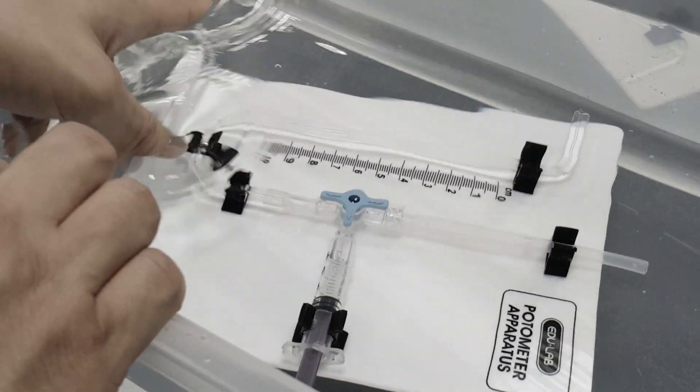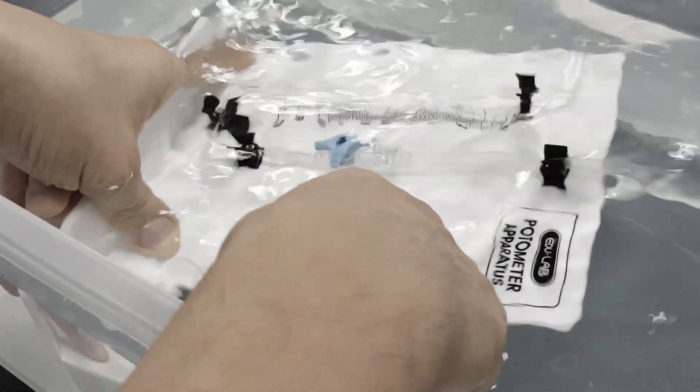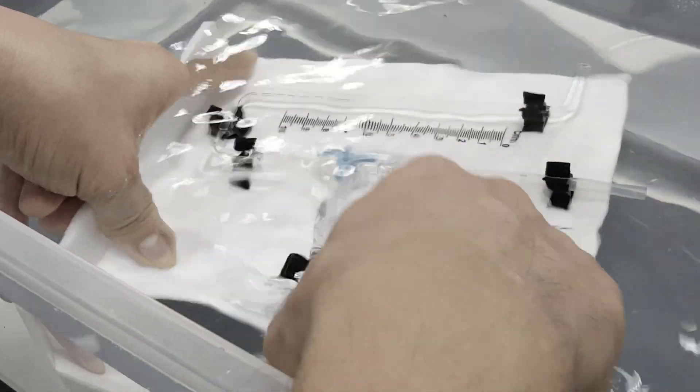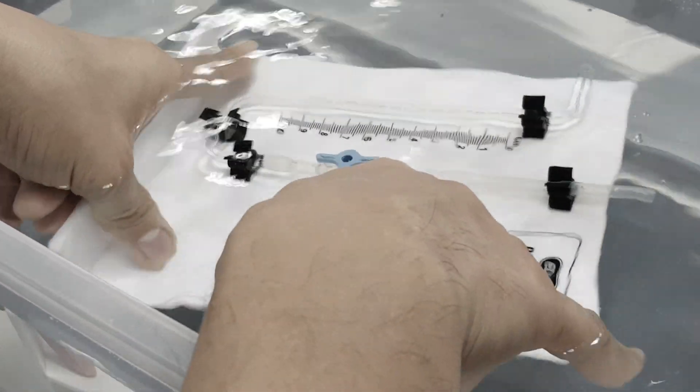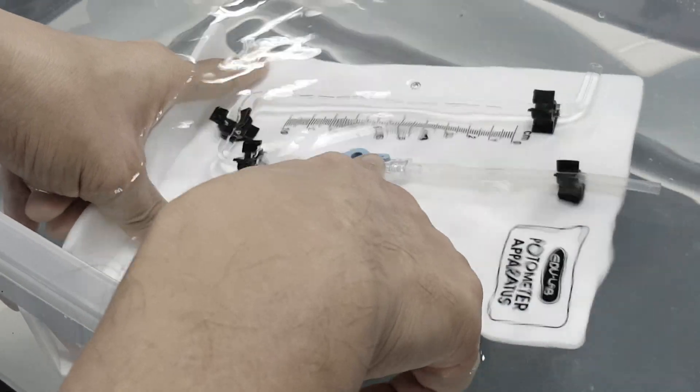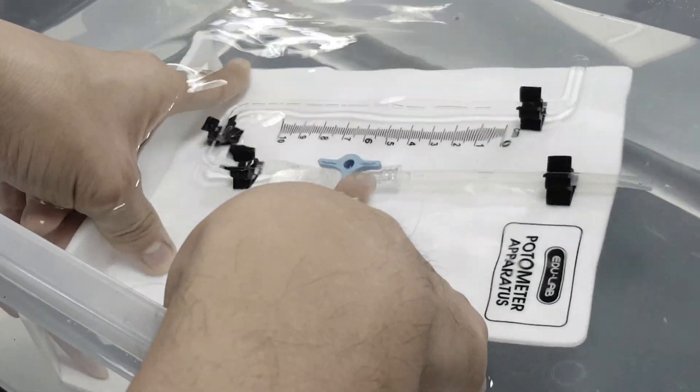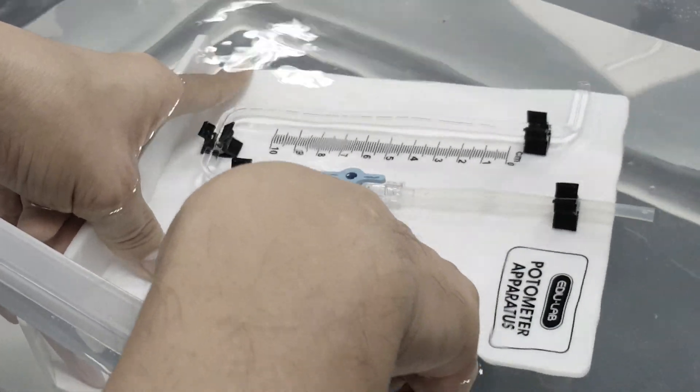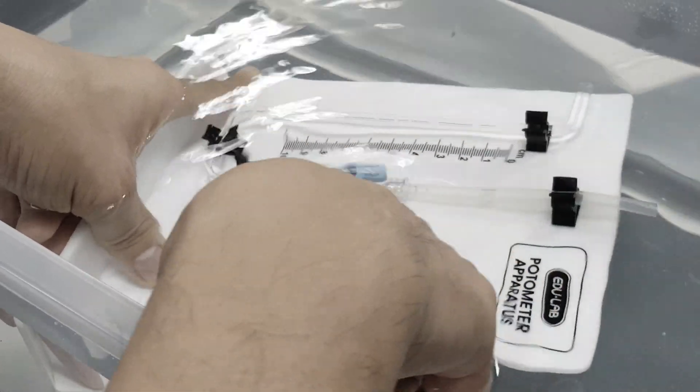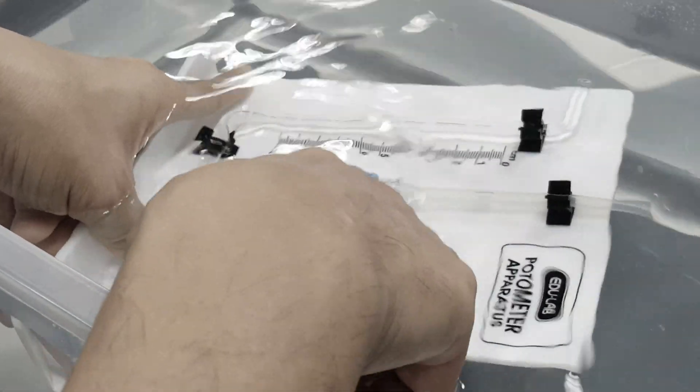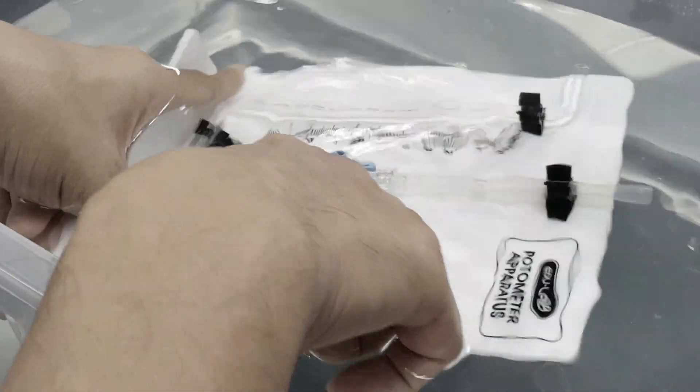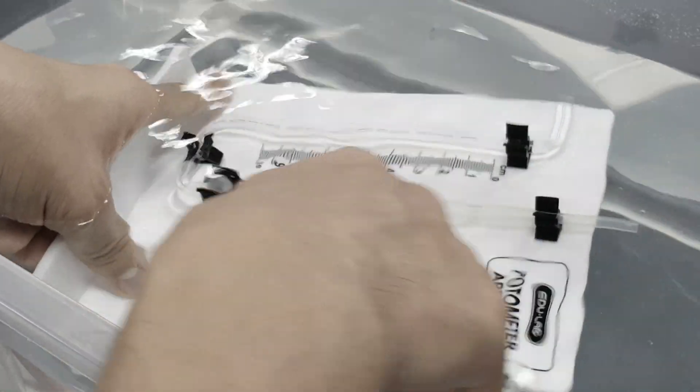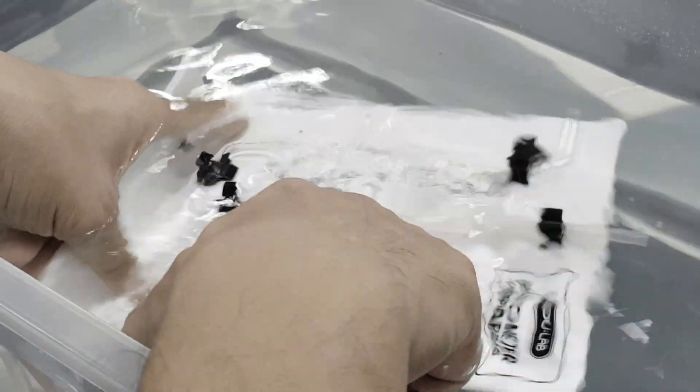Guys, you get your potometer, you put it in the tub of water. There's a kind of syringe kind of thing. You make sure this control setting controls the amount of water or air allowed to go through. It's in this setting, point up.